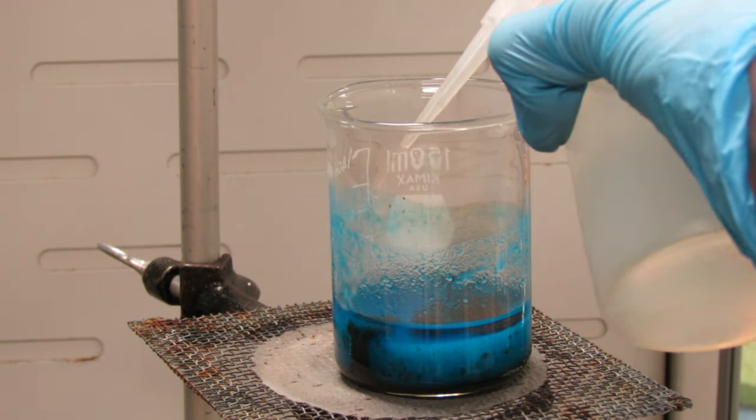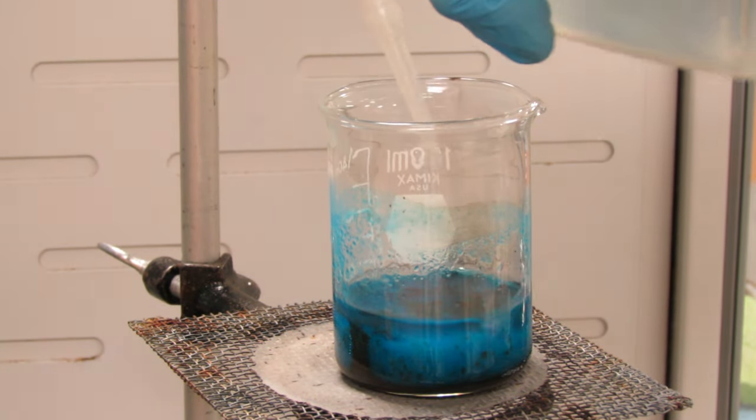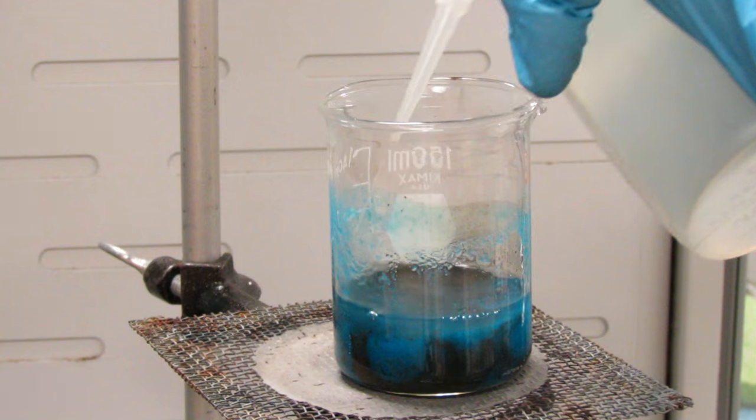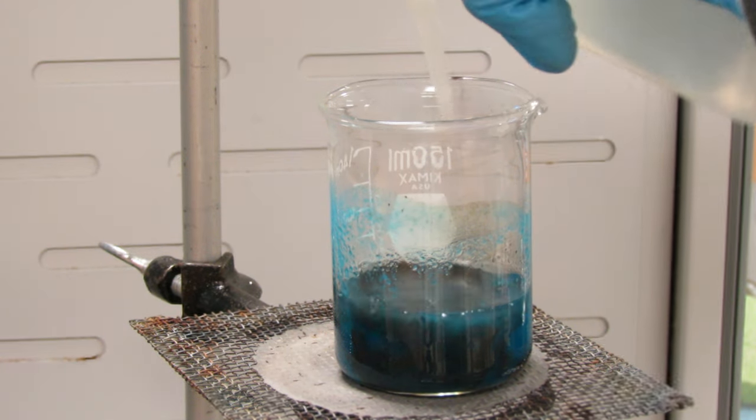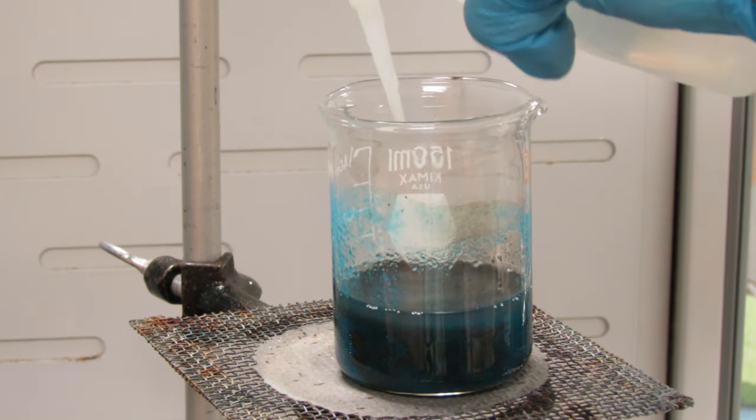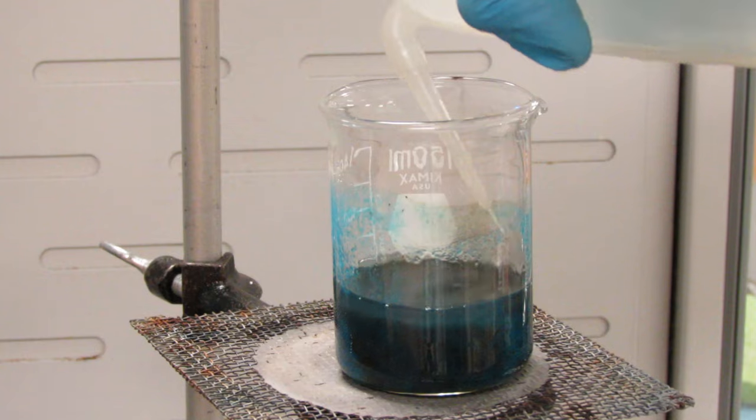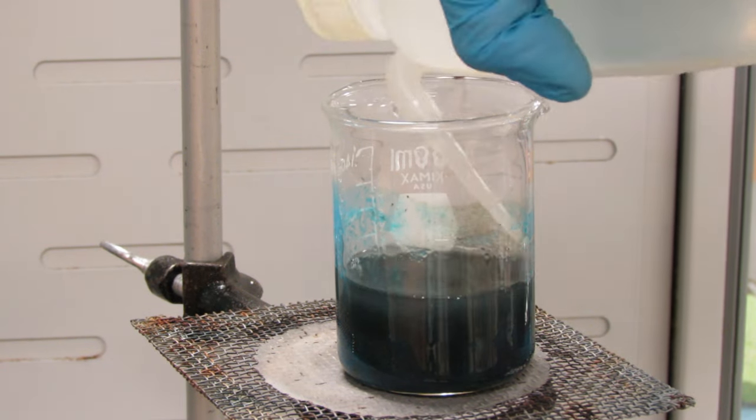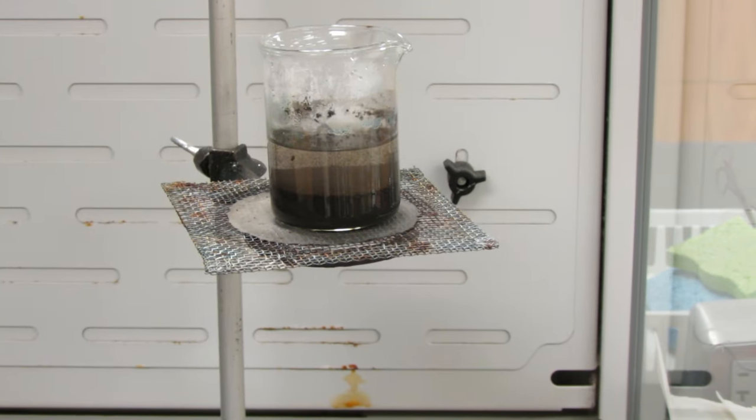I'm using a wash bottle to get all the copper hydroxide off the sides of the beaker. Now that a lot of copper oxide has begun to form, the solution is quite dark. Here's the finished product.